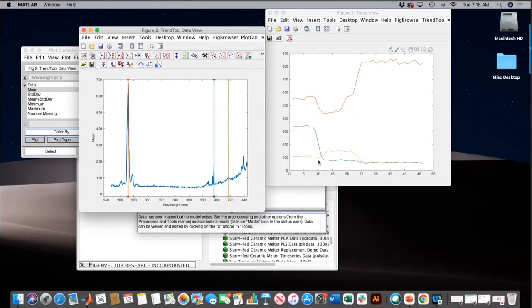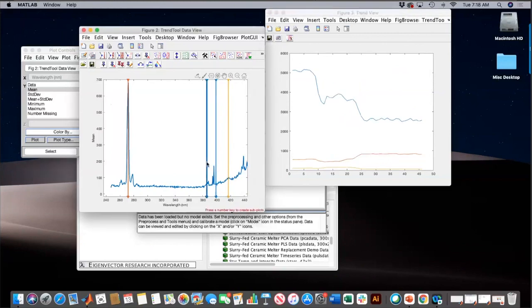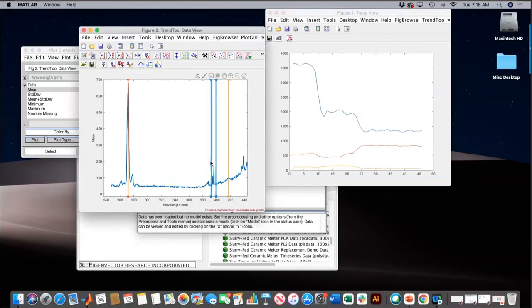But notice here that, well, for one, I'm going to do in my system, it's a control click on this, and I'm going to change it to area. So I'm going to say area, and that splits it. So now what it does is it shows me the area in between these peaks here. And now I have this going on right here.